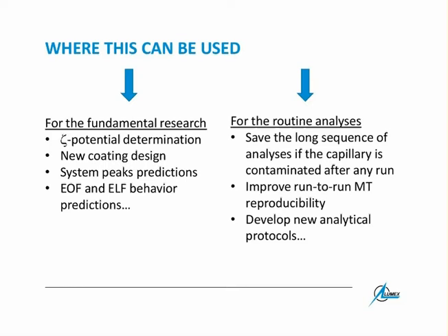But moreover, they even do not know when this coating will start degrading, slowly or rapidly, because nobody knows. All of a sudden you get results which are, let's say, not sufficient, and you don't know why, because of the sample or because of the coating, which is slowly degrading.